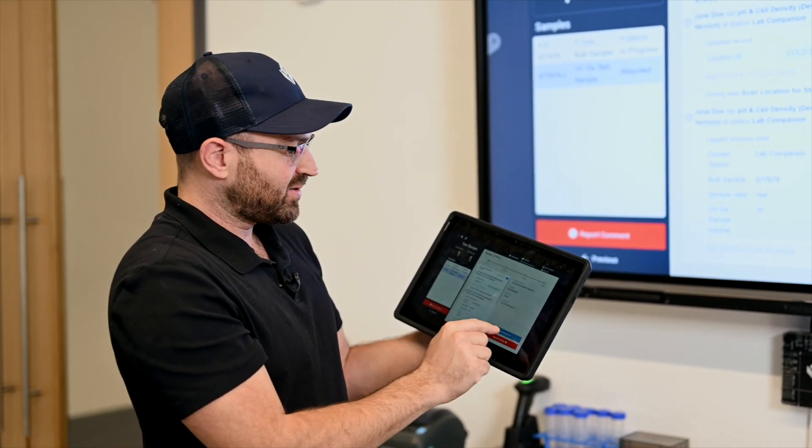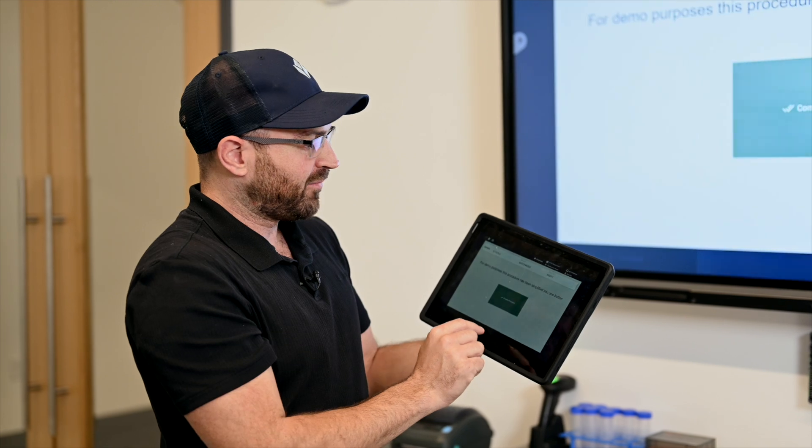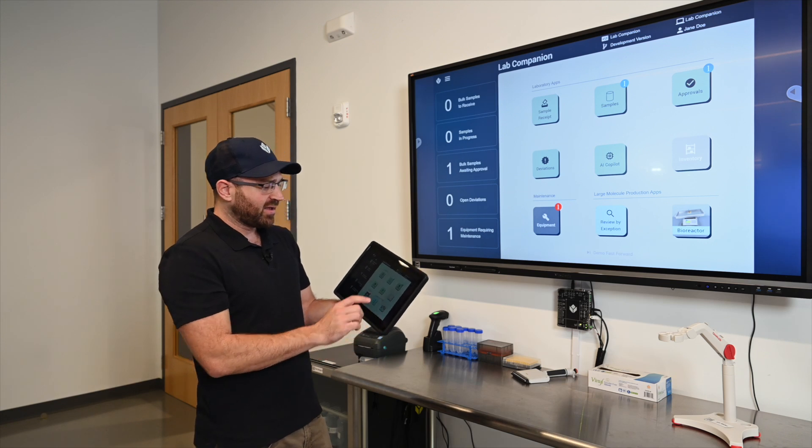In this case I'm going to execute this procedure but for demo purposes and to simplify this it's just going to be a single button that's going to complete and dispose of that sample. And now we're ready.